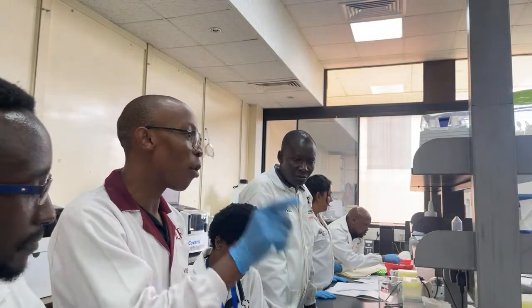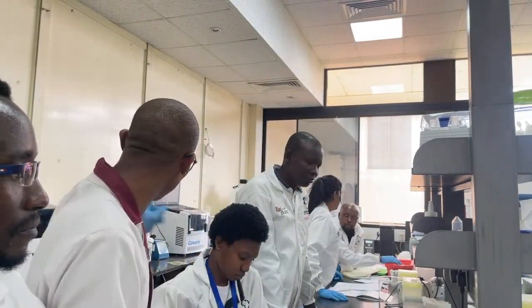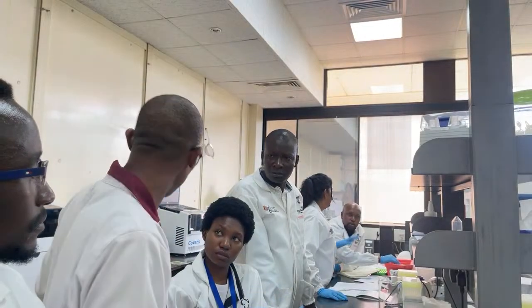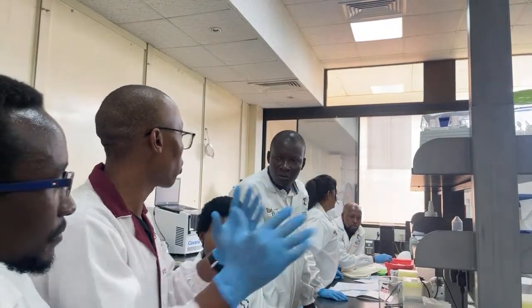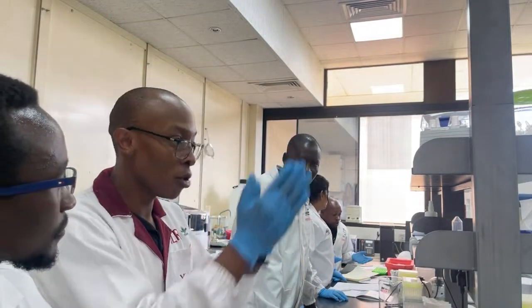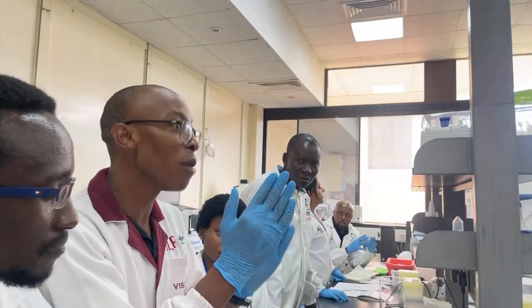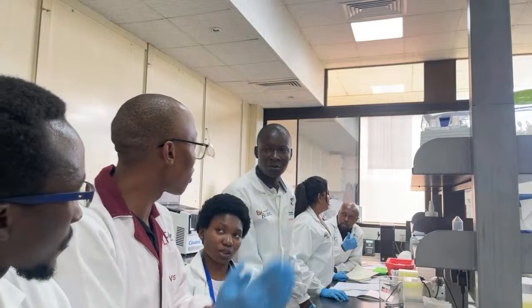The nanomolar, the number of molecules we have, is based on the average size of your fragments. So that's why any lab that wants to have an NGS machine needs to have the Agilent bioanalyzer. That's why we have those for the specific fragment size. It tells you the size distribution of the DNA that you have. So you can play around, say, okay, this is my average, but let me move this way so that I can load a bit more, so that even if I'm overestimating, I will still come back to the expected size.